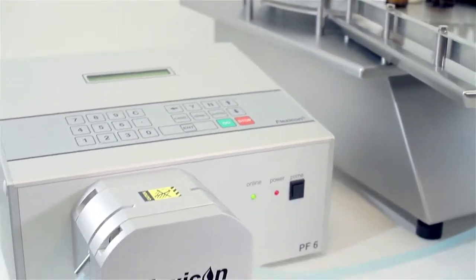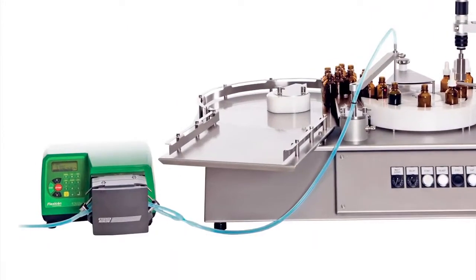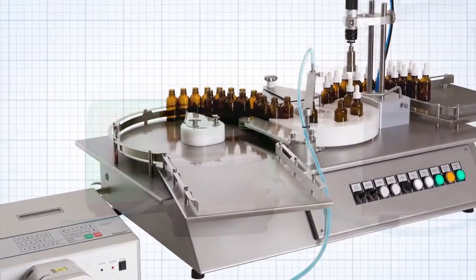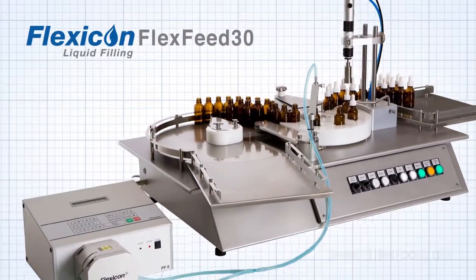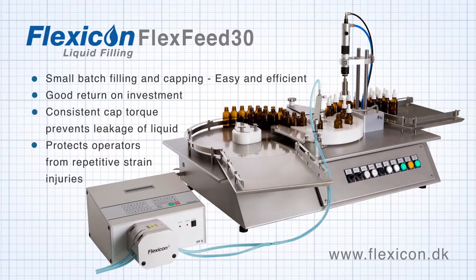The FlexFeed 30 can be connected to a Flexicon PF6 or a 520 DI peristaltic filler. The resulting benefits include a high flexibility in fill volumes, no costly overfilling, reduced foaming, and no dripping between individual fills.